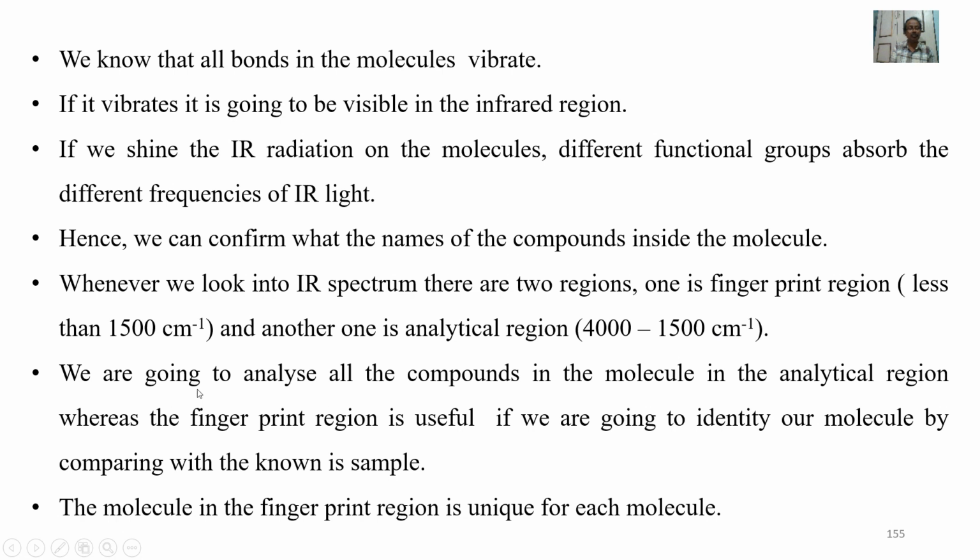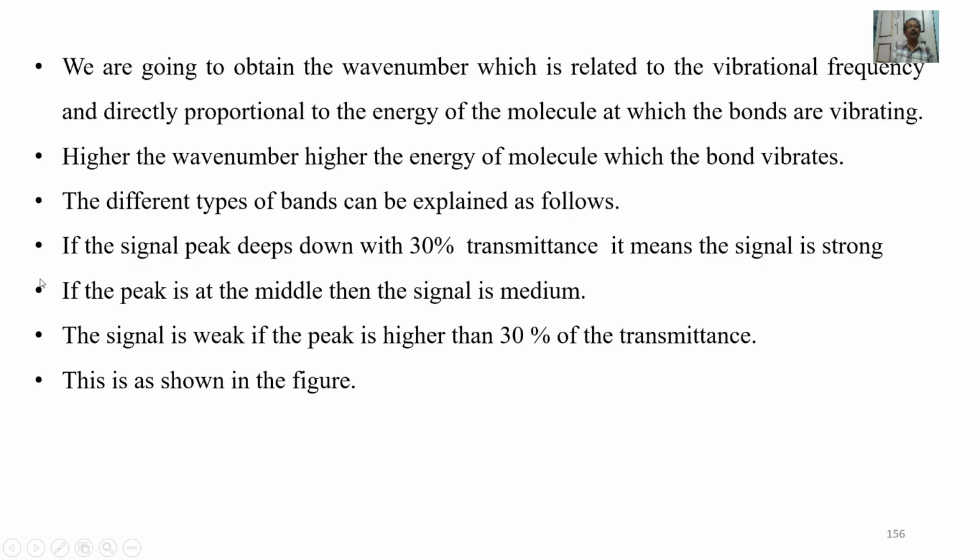But we are going to analyze all the compounds in the molecule in the analytic region, whereas the fingerprint region is useful if you are going to identify our molecule by comparing with a known sample. The molecule in the fingerprint region is unique for each molecule. We are going to obtain the wave number, which is related to the vibration frequency and directly proportional to the energy at which the bonds are vibrating. Higher the wave number, higher the energy at which the bond vibrates.